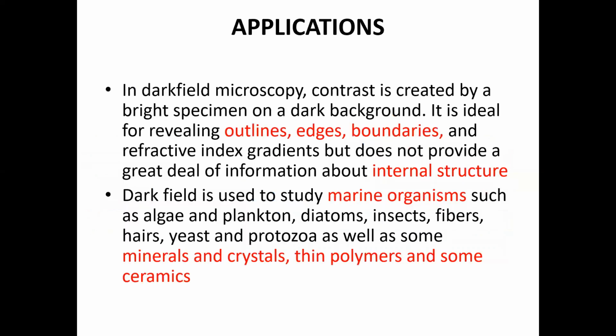So the applications: dark field microscopy, in contrast, is created by the bright specimen on the dark background. It is useful for studying the outer outlines, the edges, the shapes of the various cells, and it does not provide greater information about the internal structures.